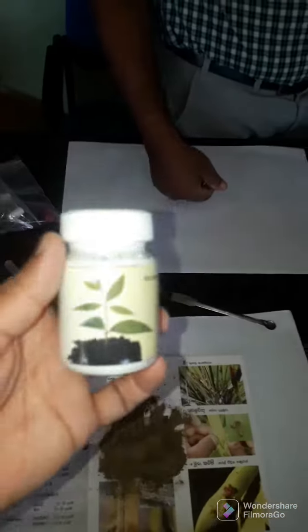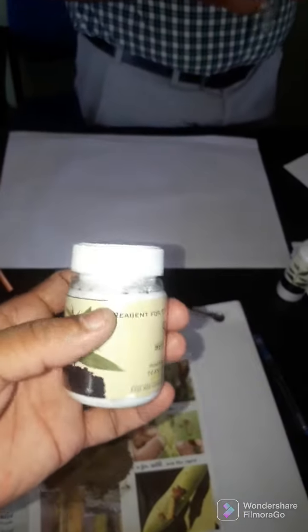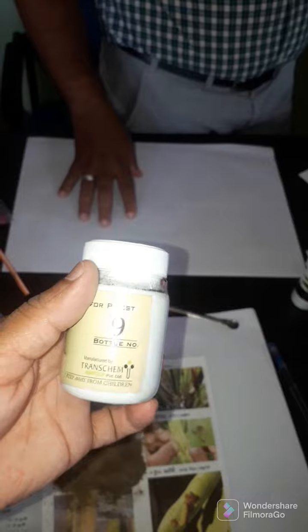First we have to collect some soil sample. Now you can observe sample of soil. To do this practical we want carbon dust and reagent 9 with reagent 8.